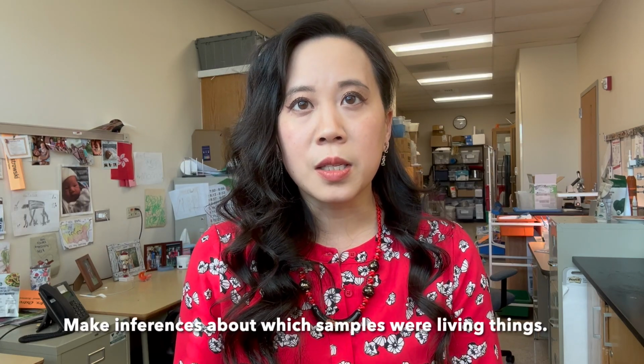Lastly, you will have to make reasonable inferences about which of the samples were once living things. You will be individually working on a microscope, so you don't have a lab partner, and this assessment is designed to be done in one class period. Mr. Bingman is going to show you how to set up your slides next.